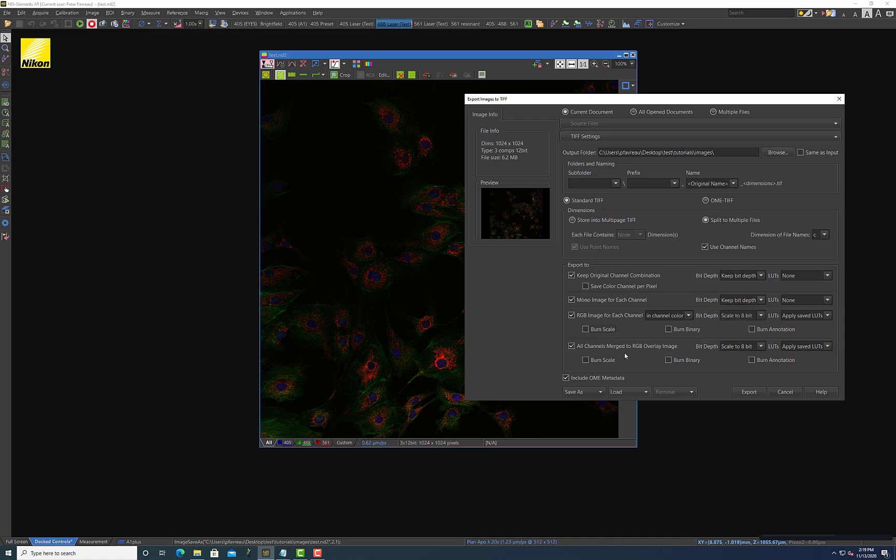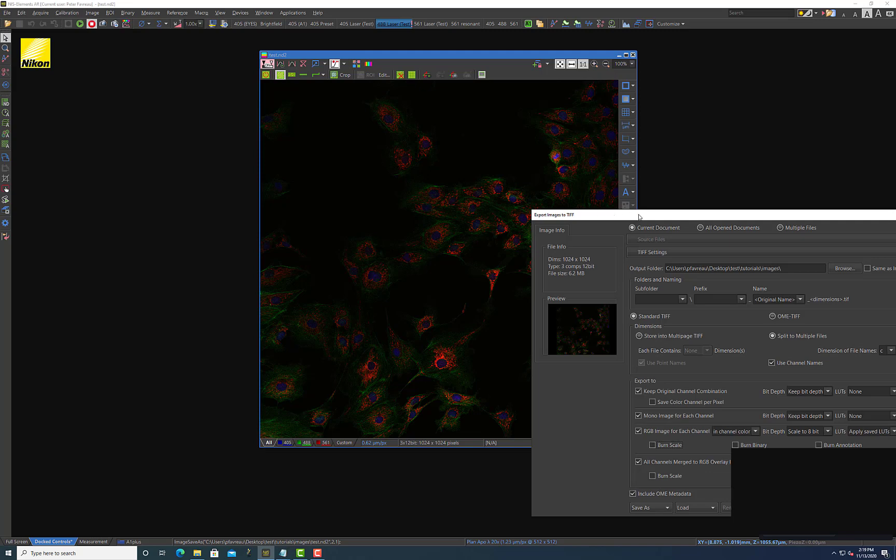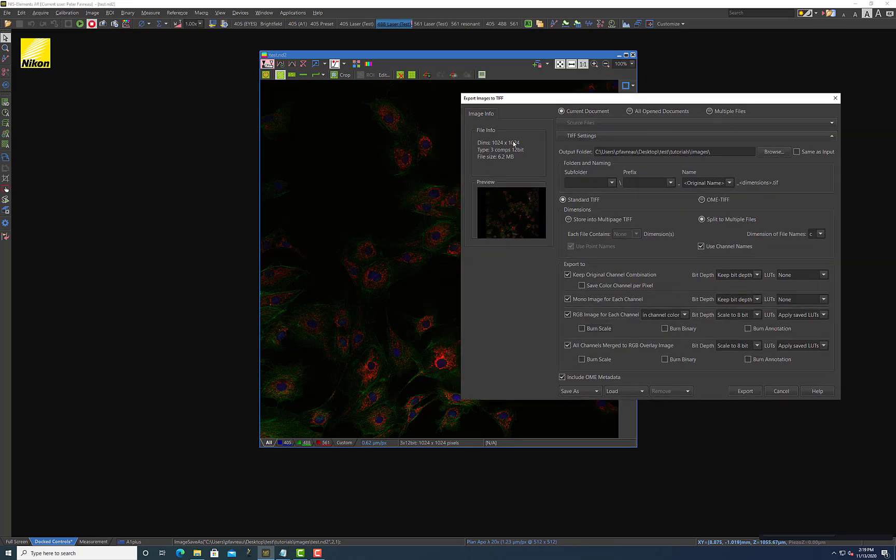Finally, there's this all channels merge to an RGB overlay image. This is basically what you see here in the background. It's going to save the images, the image as you see here where it's merged them into a single image and it saves it as an RGB image. This is again another situation where I like to scale to 8-bit so I can just send this image to collaborators, say here's what the images look like. And I'll usually apply the saved LUTs. So this is kind of a good way of disseminating your images collectively into one image so you don't have to send each channel individually.